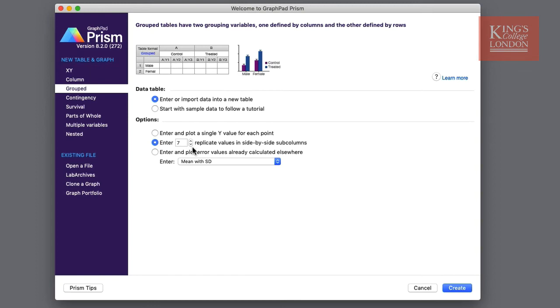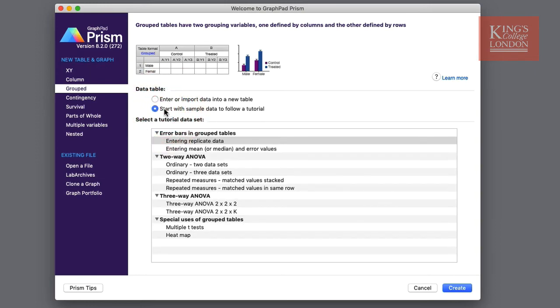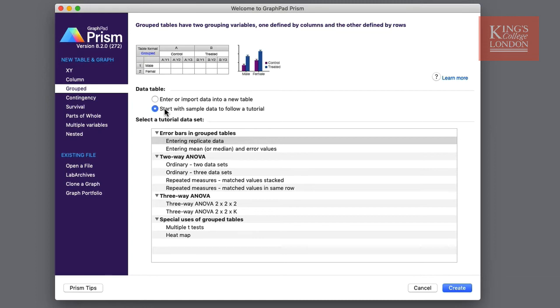If having worked through these options you can't quite decide what you want to do you can simply click on start with sample data and follow a tutorial. This will give you some options which again are different for each of the tables and graphs that you select. For instance here in the grouped data it looks at grouped tables, two-way ANOVA, three-way ANOVA and special uses for grouped tables such as multiple t-tests.